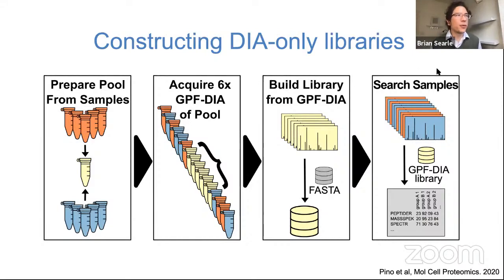So is there a difference between gas phase fractionation and DIA and just DIA, from Susanna? This is a fantastic question. It really is just a limited retention time window, mass range, as you say. It's really just taking the mass range.